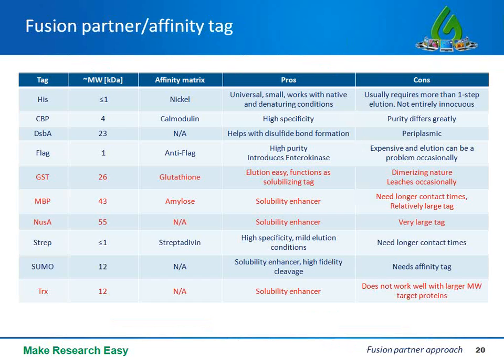So this table here lists some of the popular affinity and/or solubility tags. By the way, I should just clarify that in this webinar I've been using the terms tag and fusion partner interchangeably, so just so you know. So basically these tags are divided based on their utility as an affinity or purification tag versus solubility tag. Now some tags perform a dual role. They're both affinity and solubility tags.